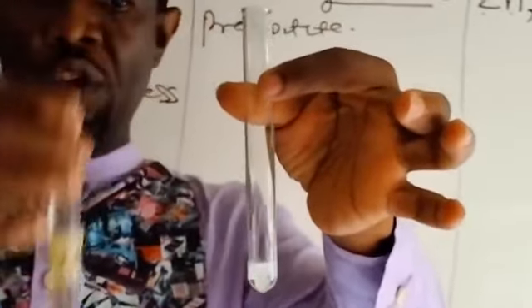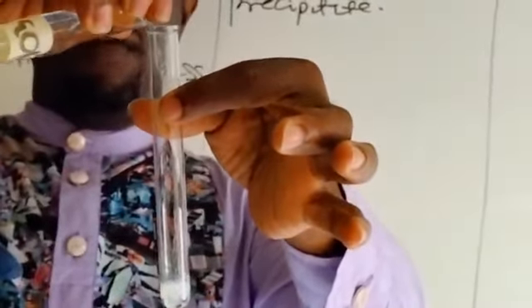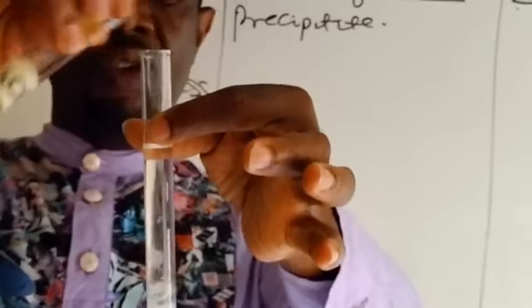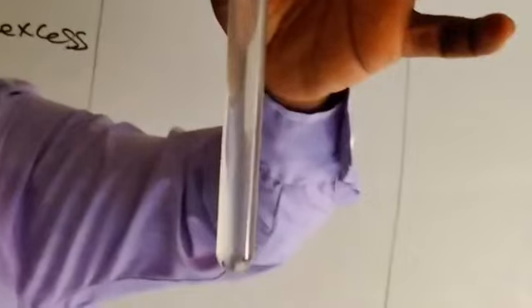So this is the white gelatinous precipitate formed. We're adding the chemical NaOH in excess to it to see whether it's going to dissolve or not. So you can see the white substances inside. So we'll now add more of the NaOH. So you see that the PPT gradually dissolves. So with time, it's going to dissolve. So you see that the PPT has dissolved. So gradually it's becoming colorless. No more solid hanging inside. So let's go to the board and report our work.